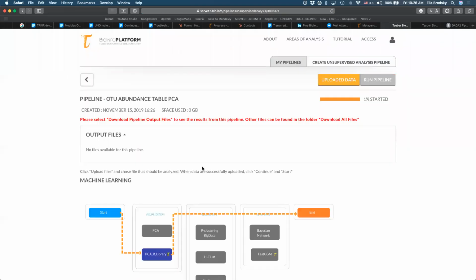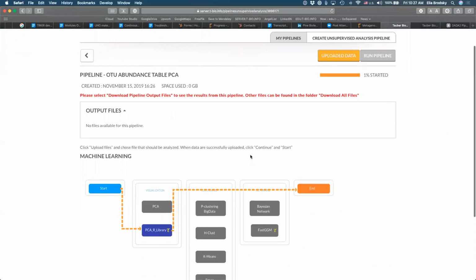And run pipeline. Okay. And by the way, does anyone have any other questions in the meantime? Because what we're trying to do is demonstrate how this information could be further analyzed, so you can have some ideas about how to actually use these methods to analyze your own data, right? If I have 2 conditions, 3 conditions, like we just looked at fecal, cecal, high fat diet and chow, how do I extract meaningful information out of this data that I can somehow interpret?